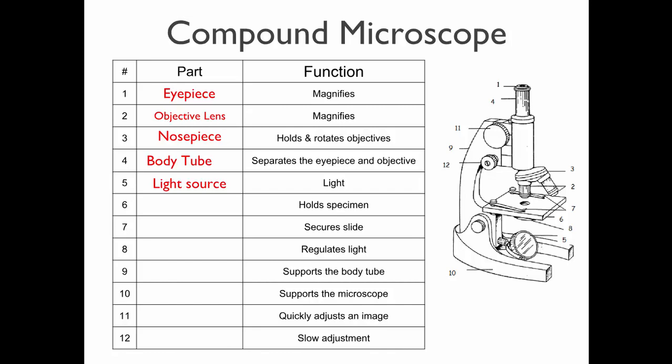This microscope is like an old school microscope. I wonder if I have any of these left. But it has not a light source there, it has a mirror. And you had a separate light source you plugged in, you aimed the light at the mirror, which reflected it up through the objective lens. So this is kind of an old style of microscope.